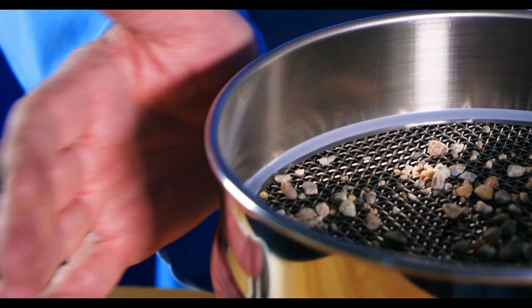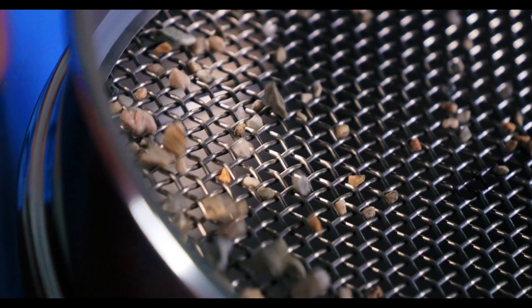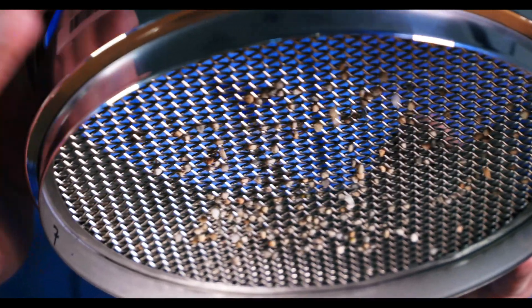Hand sieving is a particle size analysis method that's been practiced for nearly as long as humans. From ancient farmers using simple screens to separate grains and seeds, to the original gold miners discovering their nuggets, sieving has always been an easy way to separate particles of different sizes. Hand sieving is a manual process that people can perform to separate particles in a given sample quickly. It's usually performed in the field to get a quick idea of the mix of particles or look for contaminants.